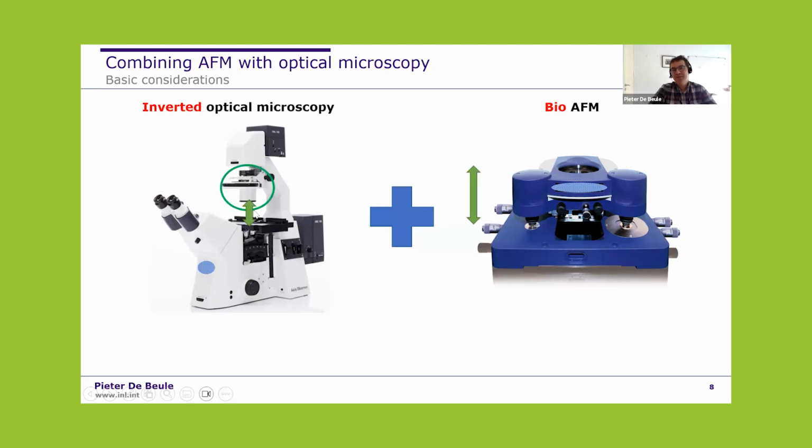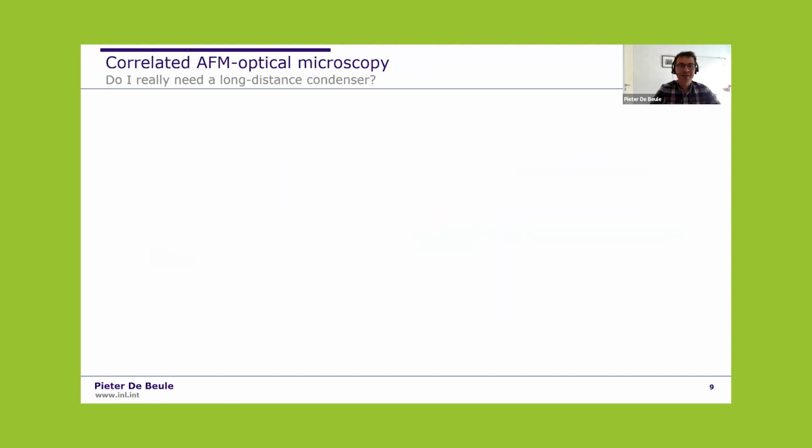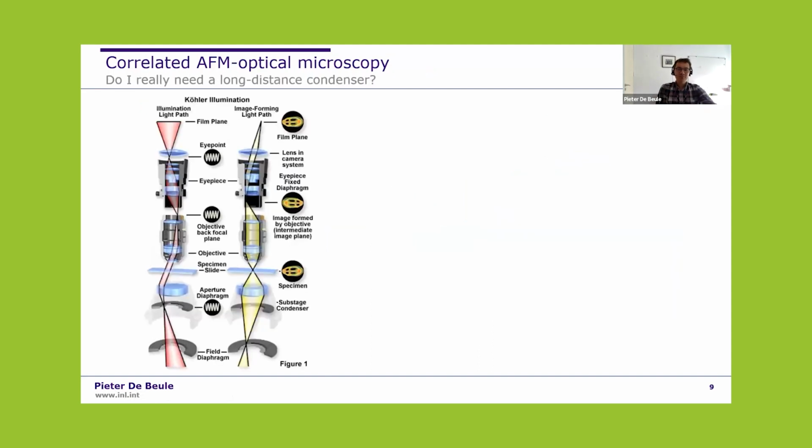You can see that you have to have enough space for that. And also the stages have to match. So when you acquire these systems, you have to watch out a little bit what you acquire so that the holes fit properly. Okay.